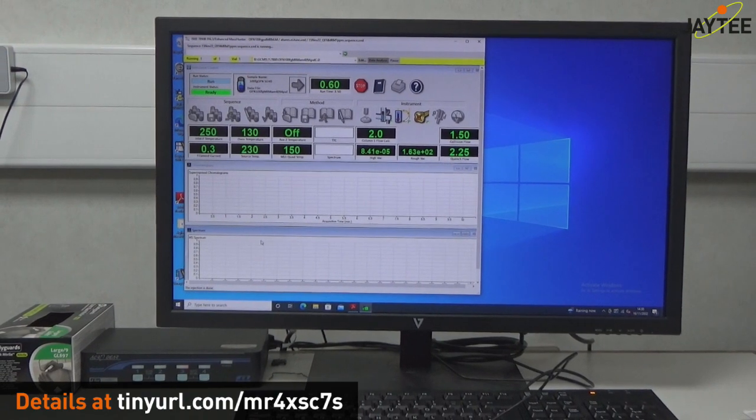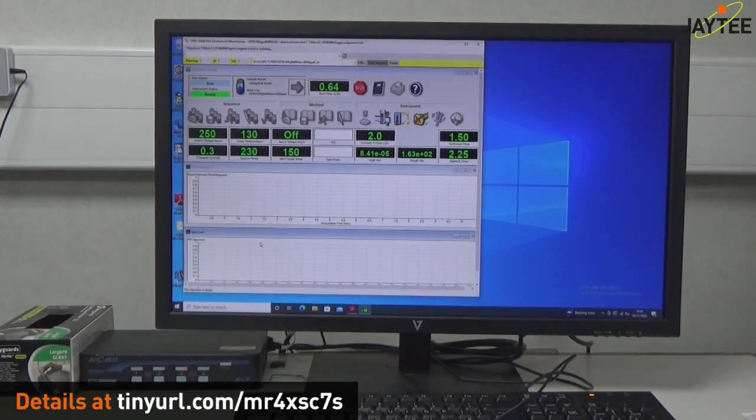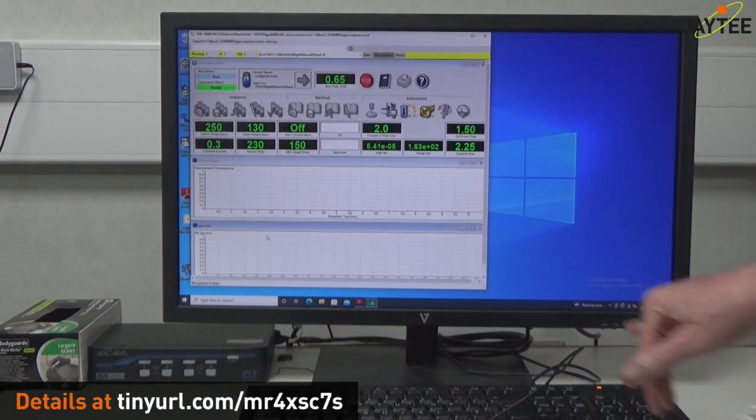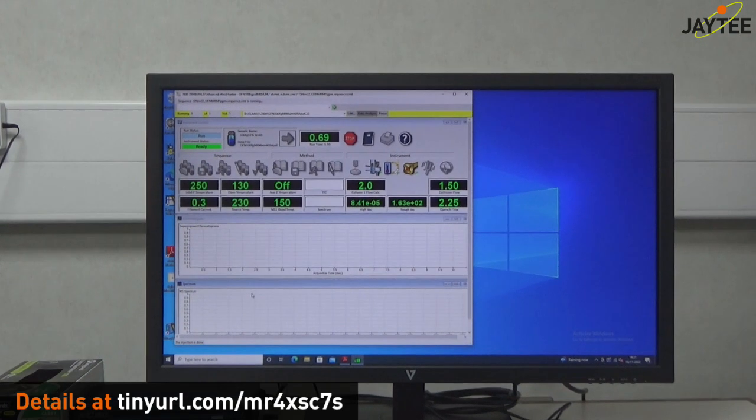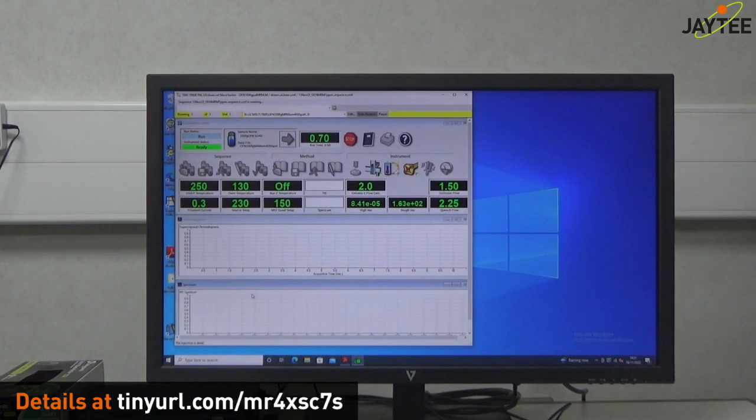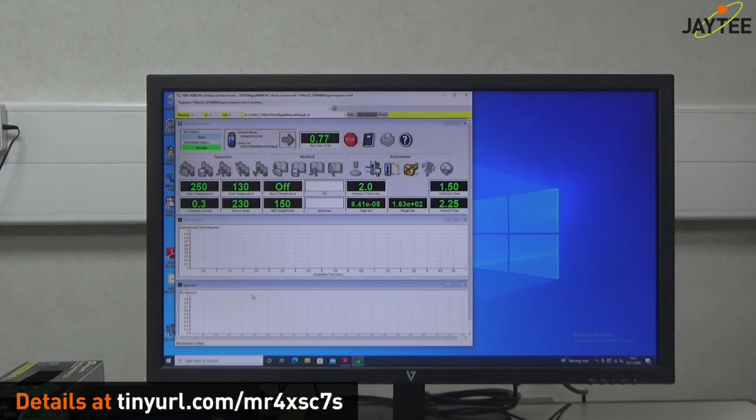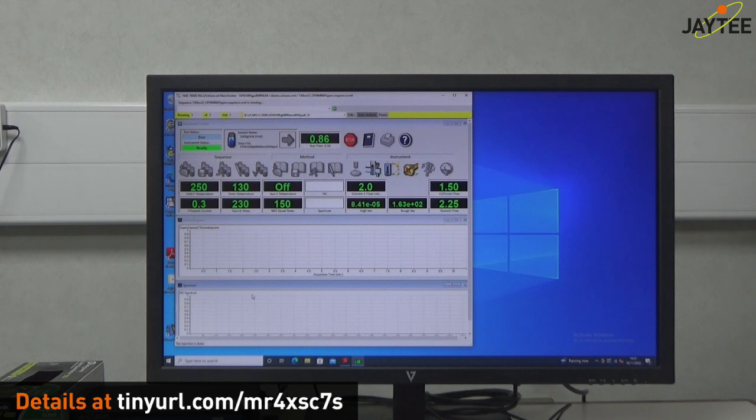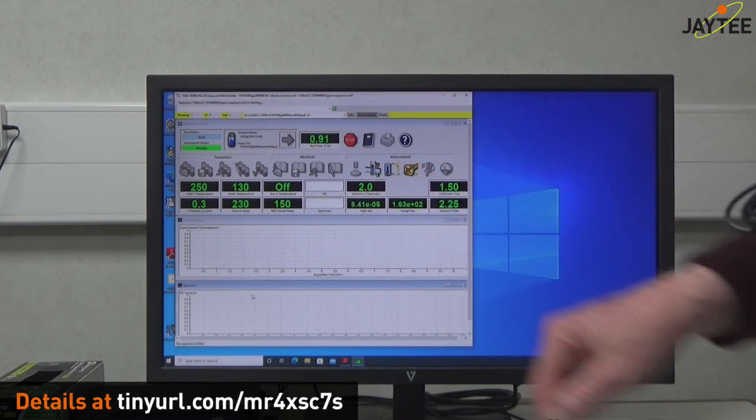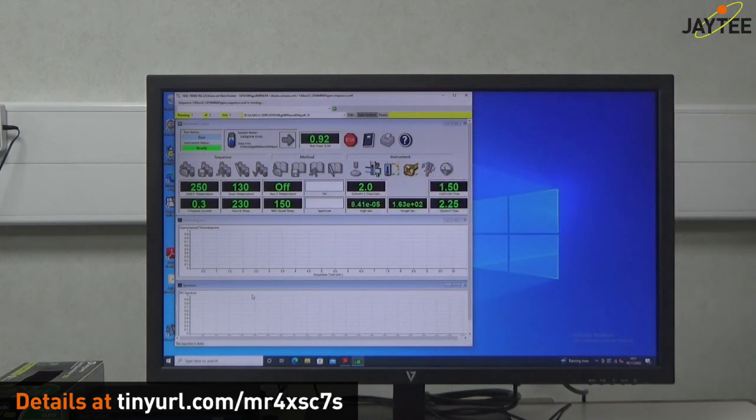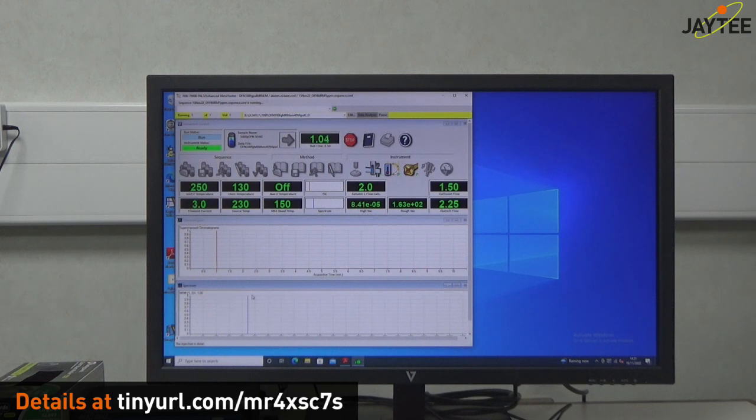You can see that it's got two vacuum systems. It's got a roughing pump on there, an Edwards 5 roughing pump. And that's currently at 1.63 times 10 to the 2 millitorr, which is 0.163 torr. And obviously you've got a double evacuation system in the actual mass spectrometry itself. And that's currently at 8.41 times 10 to the minus 5 torr.